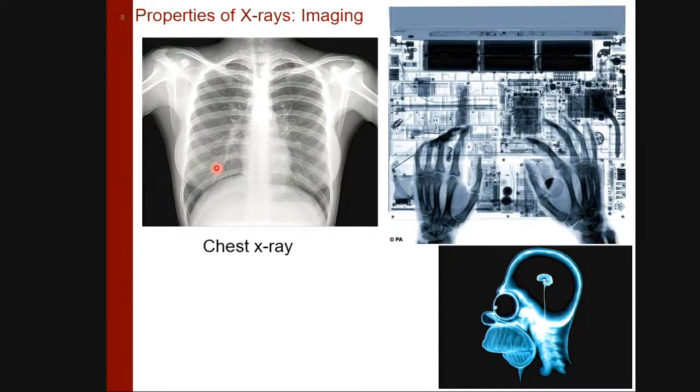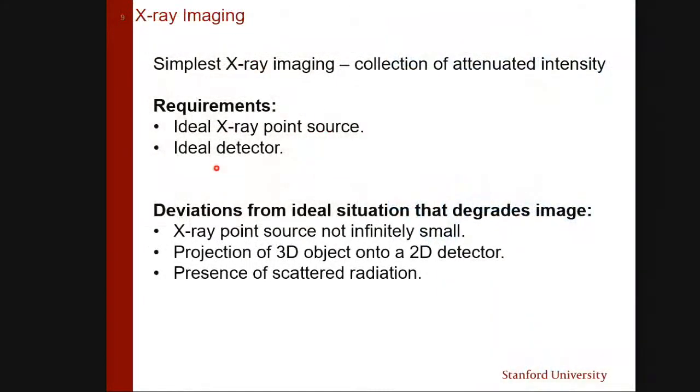In tomography, we will do more than that. So we'll try to understand where the things are in the volume. So that's a big difference between imaging and tomography. And I will try to tell you roughly how this tomographic imaging is done.